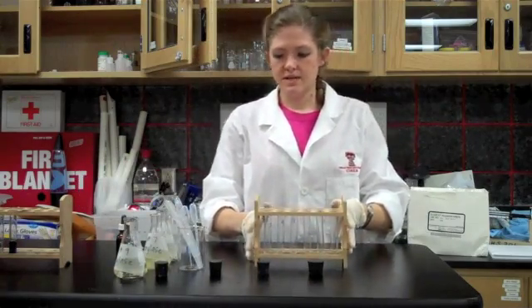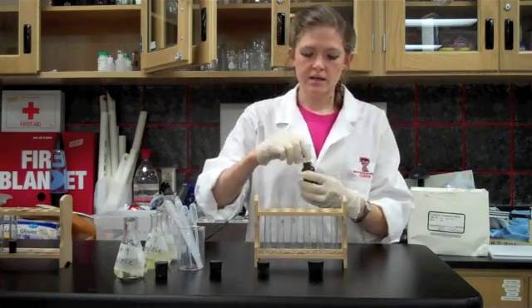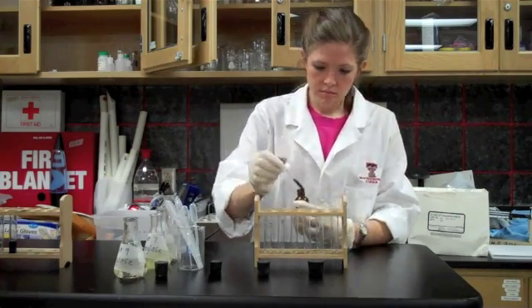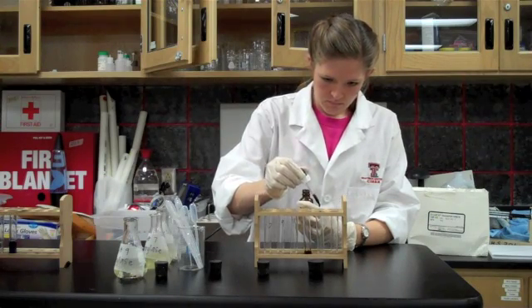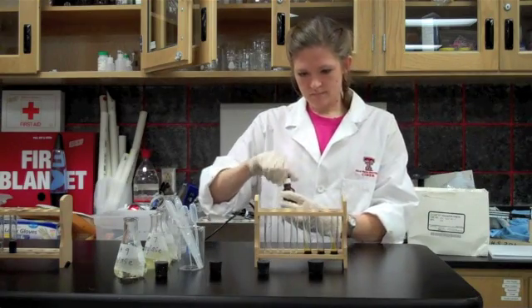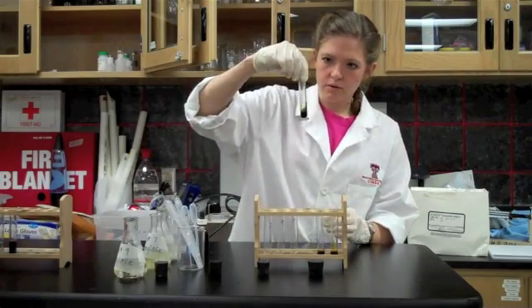Now I'm going to take my iodine and put two drops of iodine in each of the test tubes that have starch in them. I'm going to swirl them.